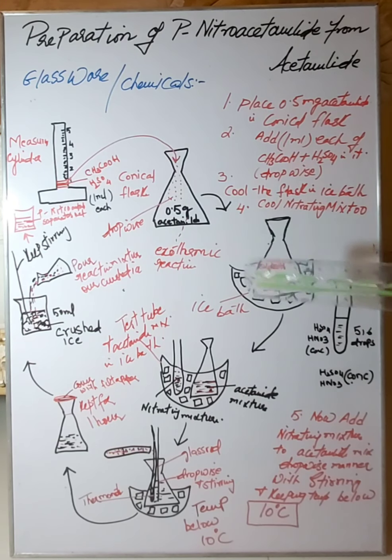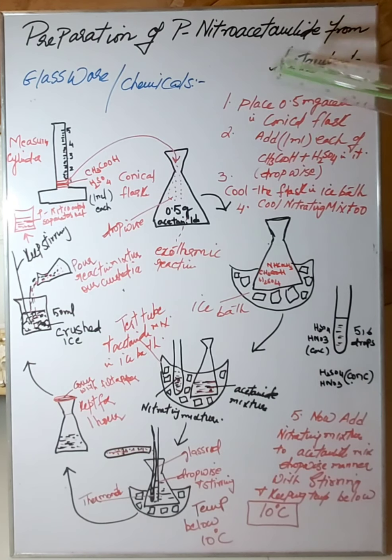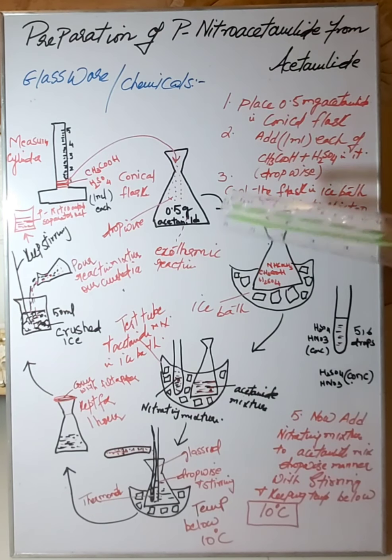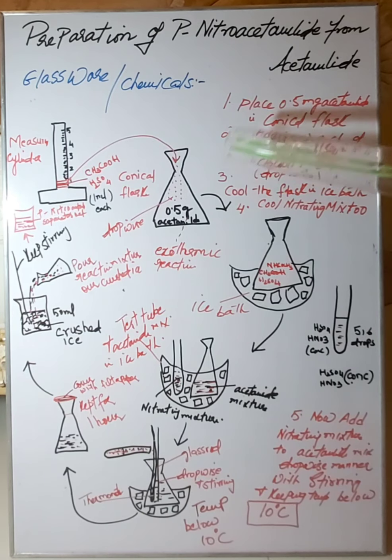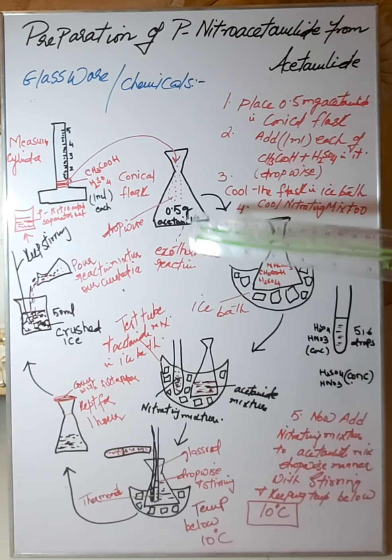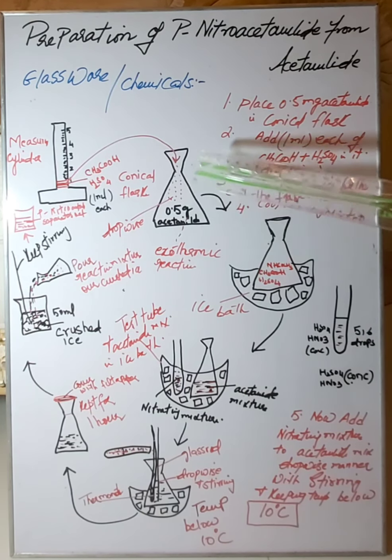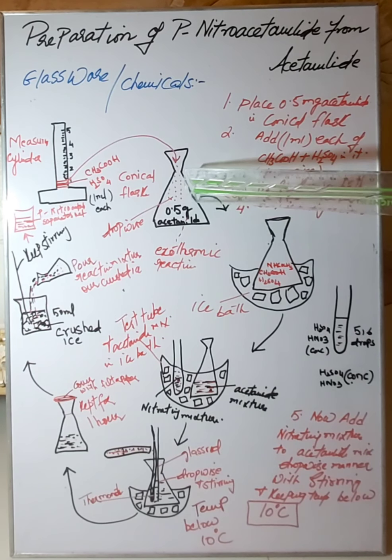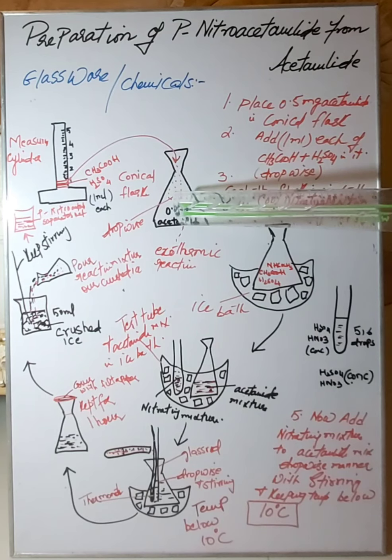Now here you are going to prepare this para-nitroacetanilide from acetanilide with a series of steps, right? So the first step is to place 0.5 gram of acetanilide in a conical flask. So this is a conical flask. You will weigh 0.5 grams on the weighing balance, and then you will place this inside this conical flask.